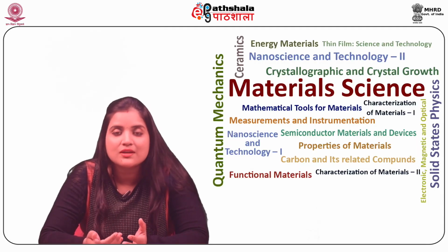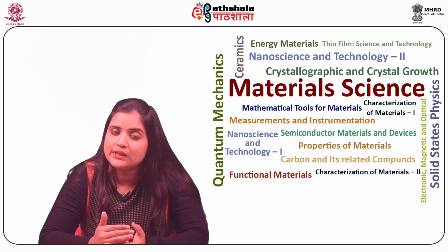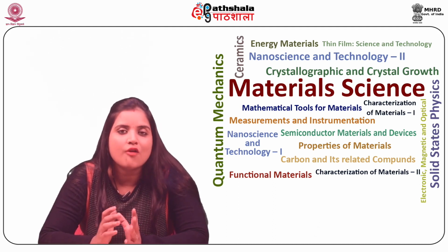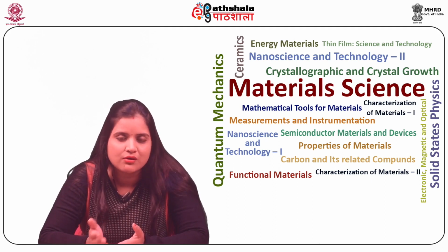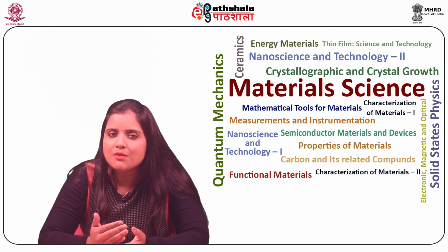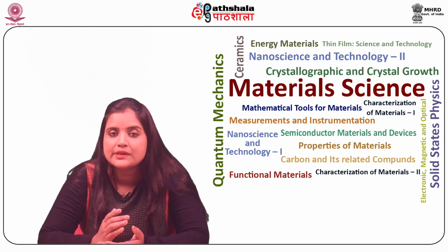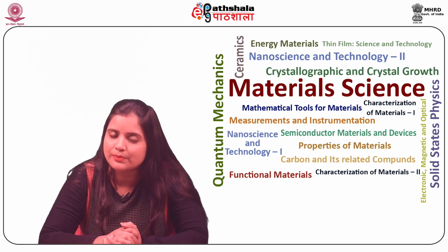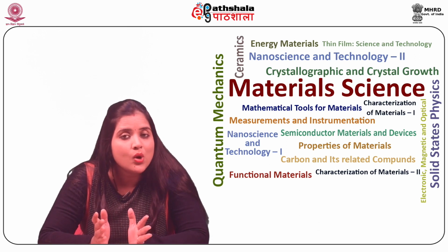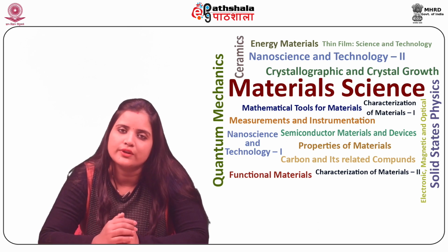Let us now discuss the advantages of STM. Firstly, the resolution of STM is not restricted by diffraction, and therefore it can be of the order of a few picometers. Secondly, the interactions between the probe and the sample extend only across the tip atom or atoms involved in the interaction.